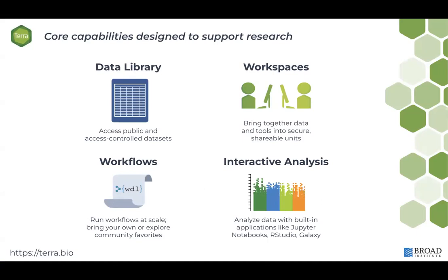There are all sorts of workspace access controls in order for data to be able to be shared in a secure and immediate fashion. And we have two different analyses modes. We have workflows, which are basically ways to run very scalable computations.